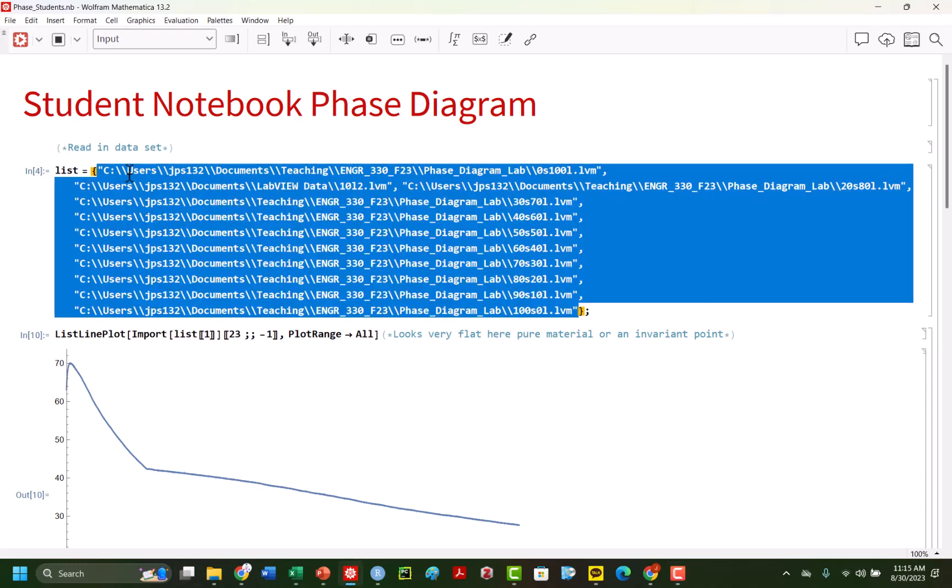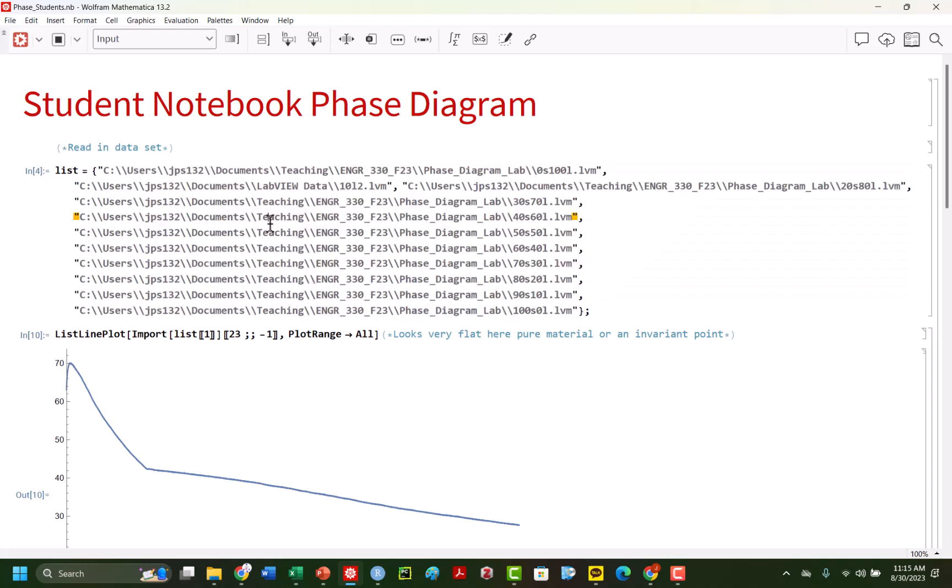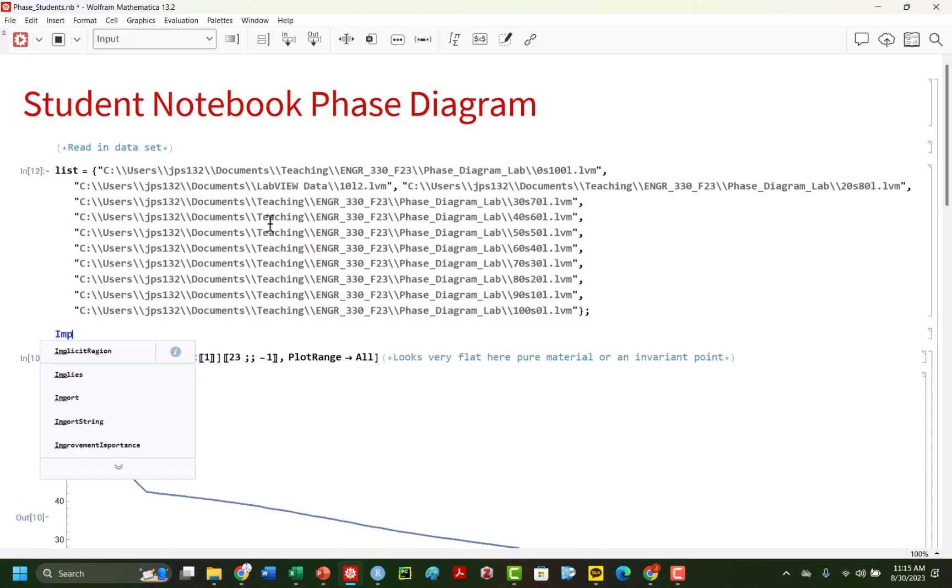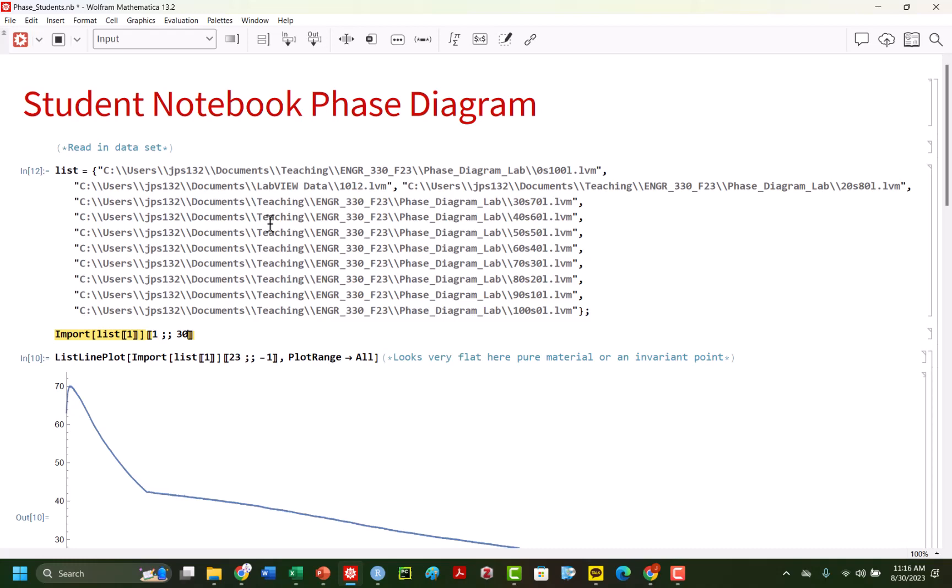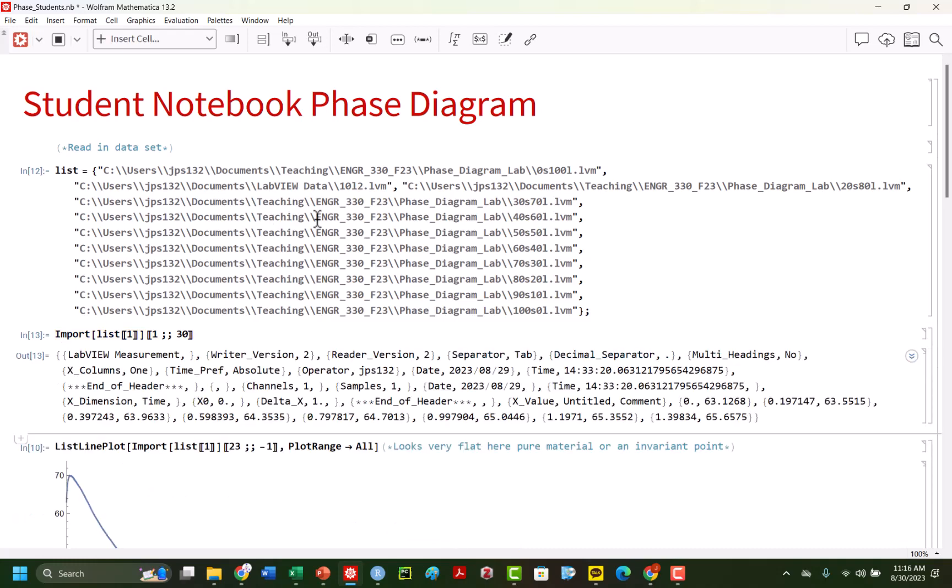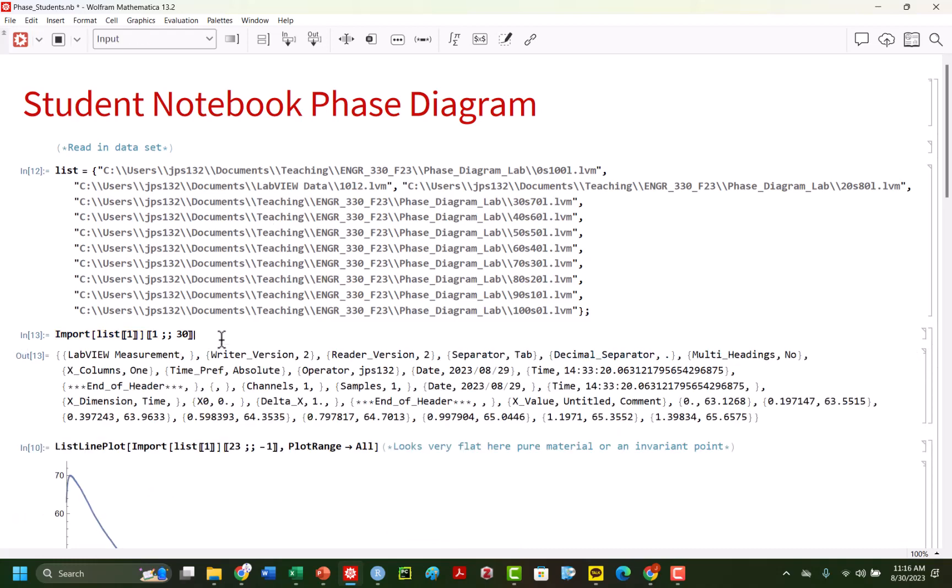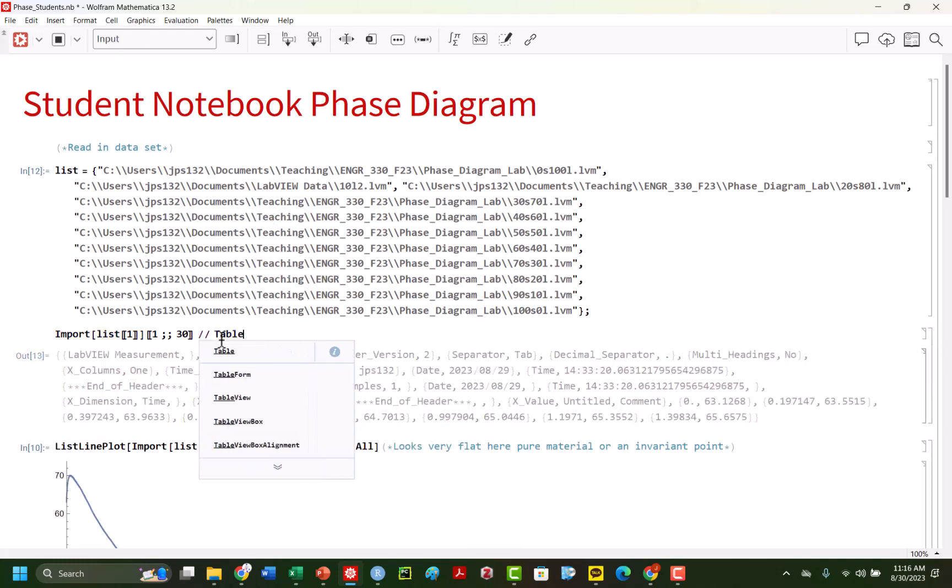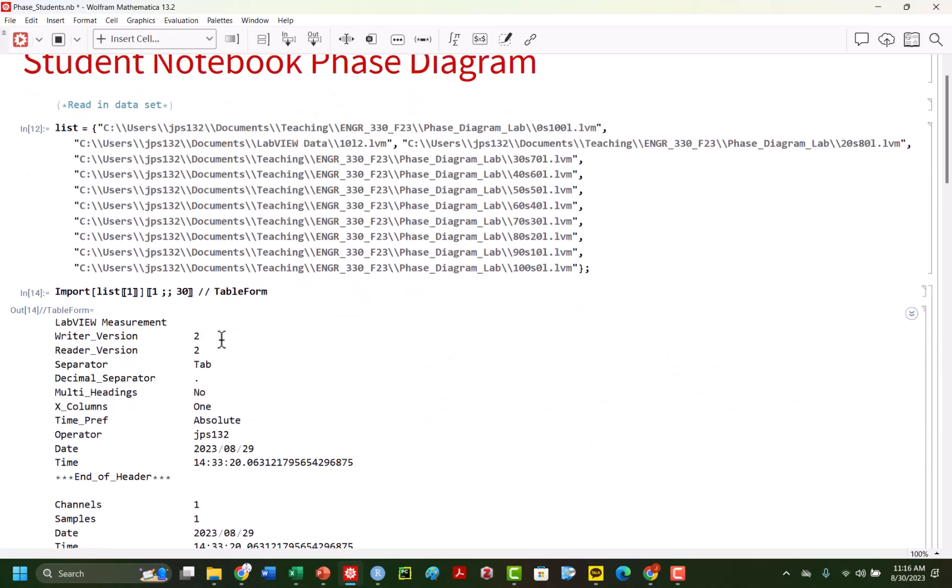So you're going to copy essentially all of those files that we looked at previously, actually that we gathered from our thermocouple. And if you take a look at these files list, again, it's always good to just take a quick sneak peek. So let's look at maybe 1 through 30. And let's look at it in table form just to kind of get a sneak peek of what we're going through so we can clean up the data set.